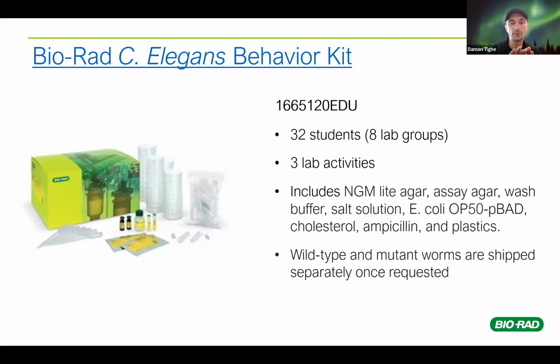So let's talk about some of the stuff that you could accidentally do that might get you different results. If your worms grow for too long, they can start to associate salt with living in a busy, crowded place they don't like. And so when you do the assay, you'll notice that the wild type worms go away from the salt because they learn to associate salt with being crowded, and that's not something that they like.